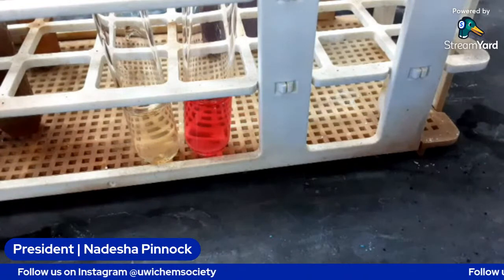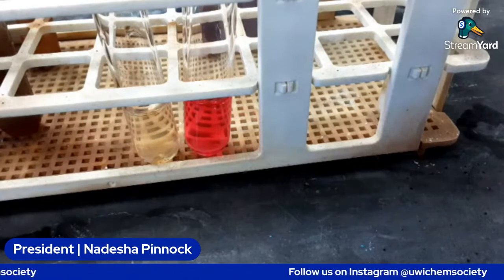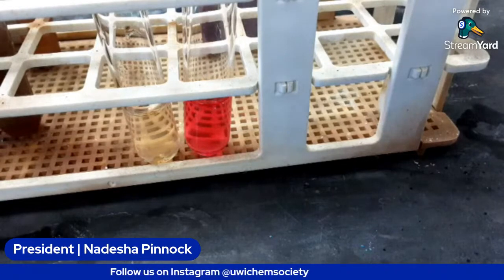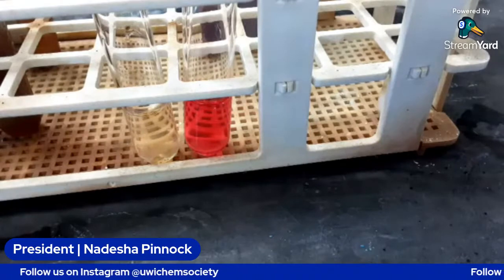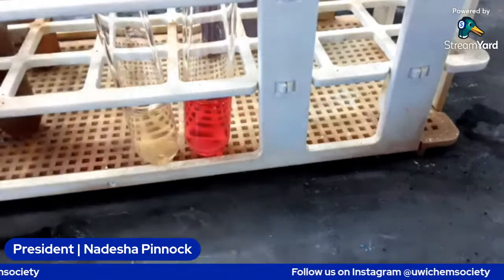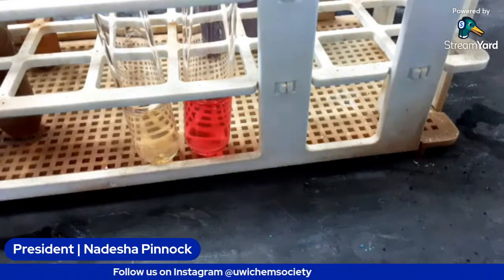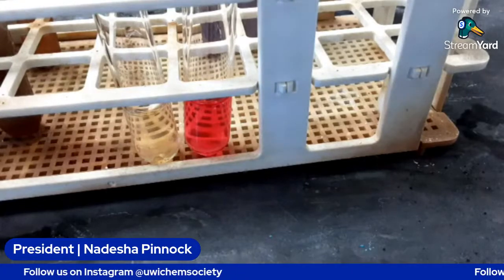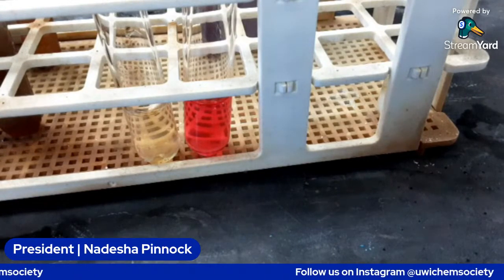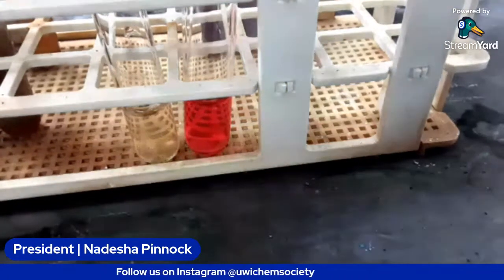We're going to add some acid first to them, and then we're going to neutralize that acid. The acid is going to break the glycosidic bonds, any that are present. Then we're going to neutralize that acid so that we have a slightly alkaline solution, and then we're going to add the Benedict's, because the Benedict's has to be in alkaline solution.